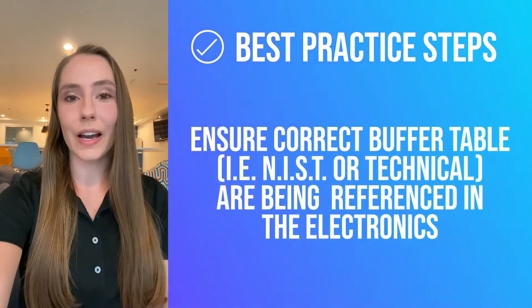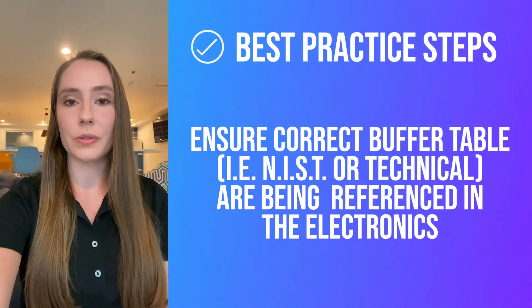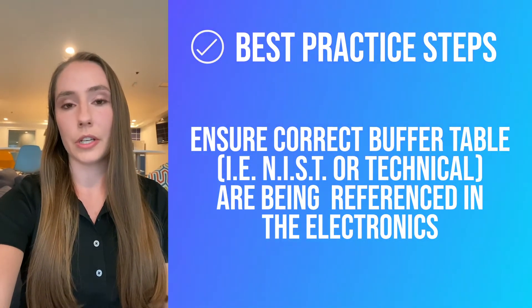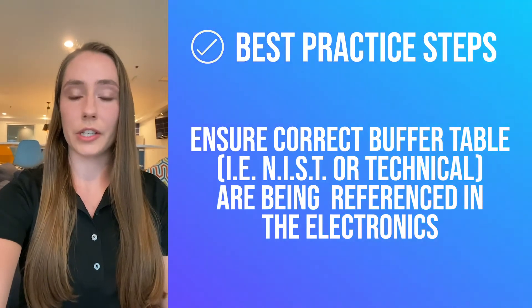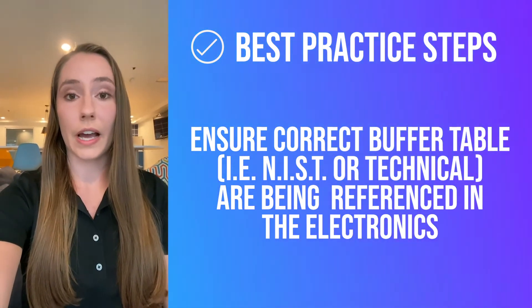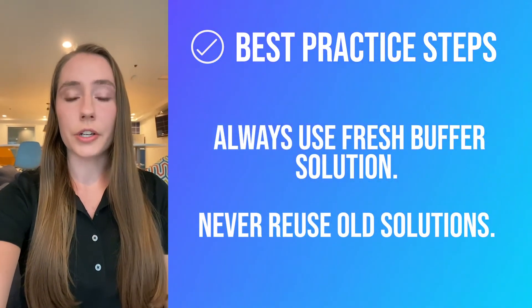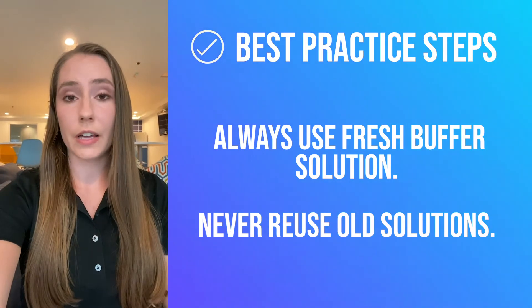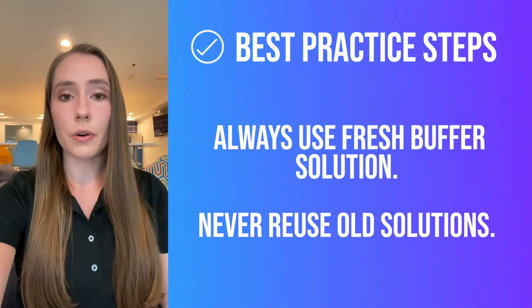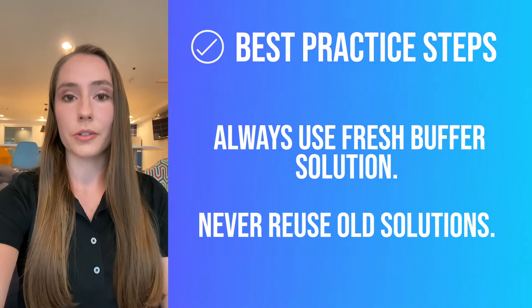The second thing to keep in mind is that you're using the correct buffers. This needs to be programmed into the analyzer before you calibrate — it's normally under the calibration menu, where you can choose the buffer set you're using, such as NIST, DIN, or US. You also want to make sure that you're using fresh buffers every time, as they can degrade if exposed to air, so never reuse old buffer solutions.